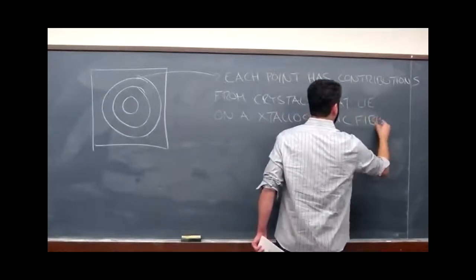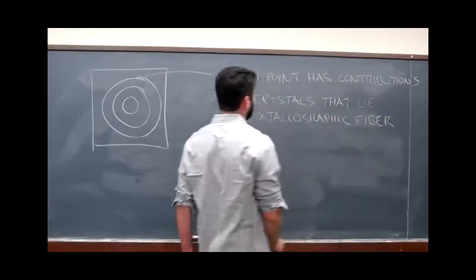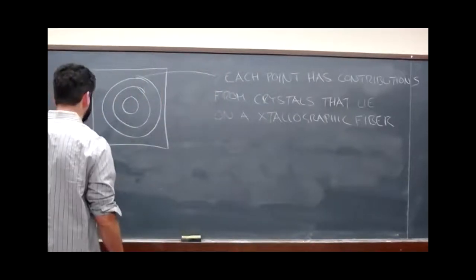Which just meant that all these orientations share one direction in the crystal coordinate system.